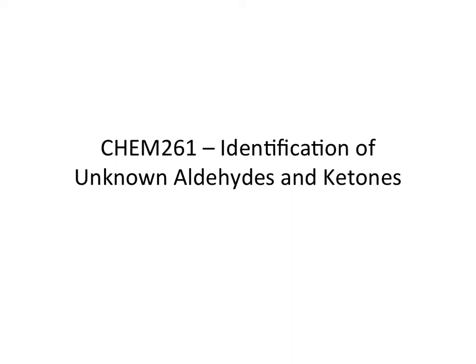This is our lab introduction for the laboratory for identification of unknown aldehydes and ketones. We're going to use some classic reactions of aldehydes and ketones. These are things that could be used in other types of synthetic reactions, but we're going to use the products of those reactions to identify unknown aldehydes and ketones.